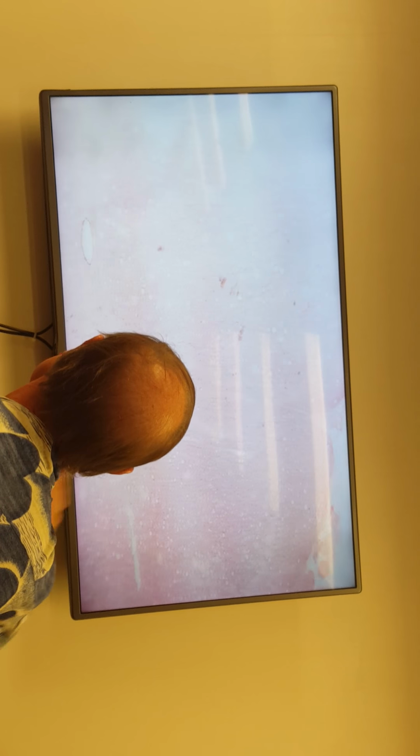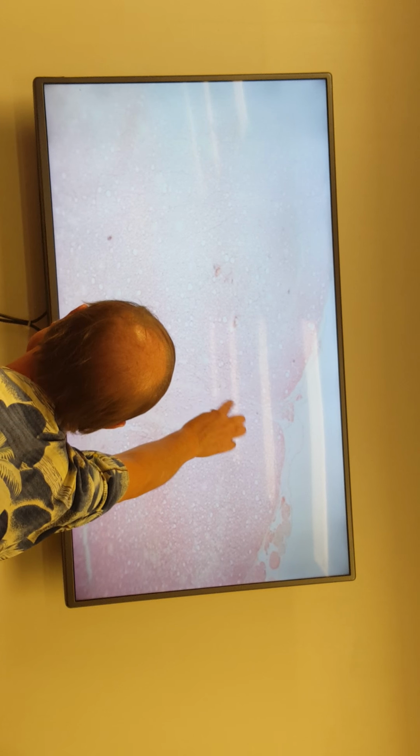I see these dark little structures, and what would those be? Those little dark structures would be the cell bodies of motor neurons. And they would be located in the ventral horn of the gray matter. So this is all ventral horn, lateral horn, and you see that kind of spike that goes all the way up. See how it goes right up to the edge? Dorsal. You know immediately that has to be the dorsal.